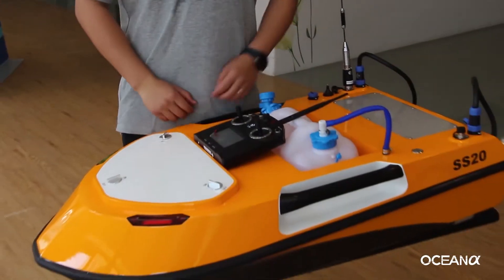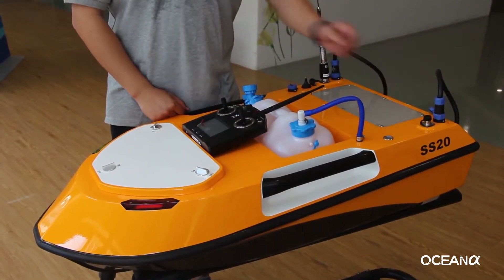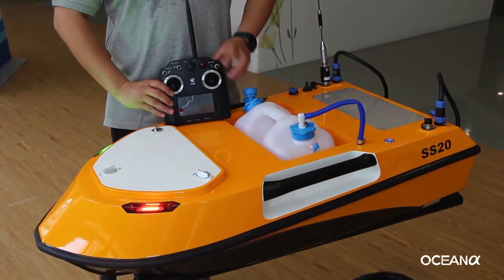Test the USV after installation is done. Turn on the USV. Turn on the remote controller.